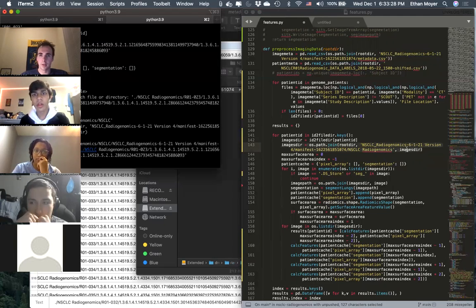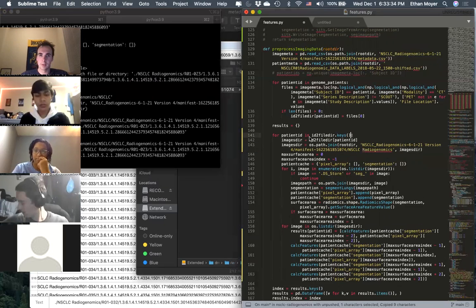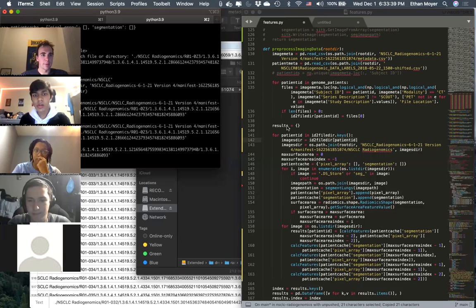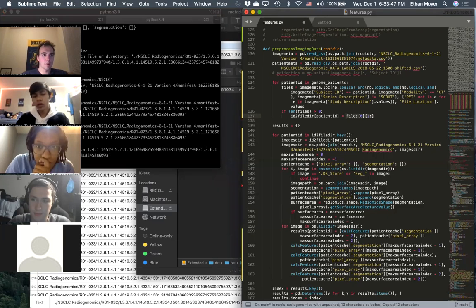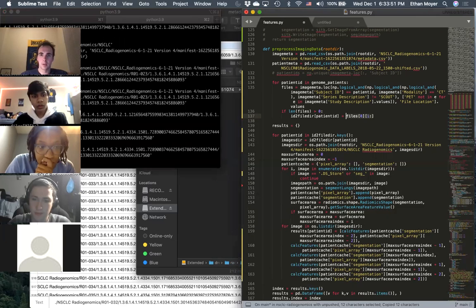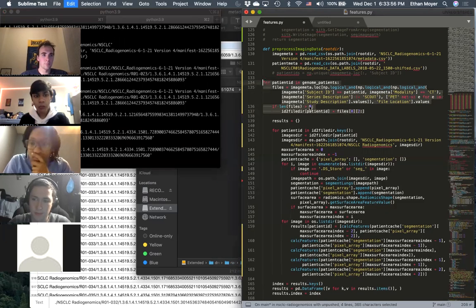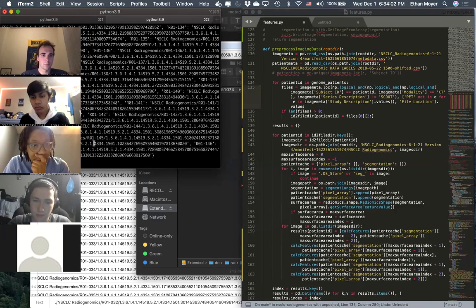Hello, what's going on here? Guess image dir is a. I don't like that period right there. That makes me upset. What we'll do then is, there we go.